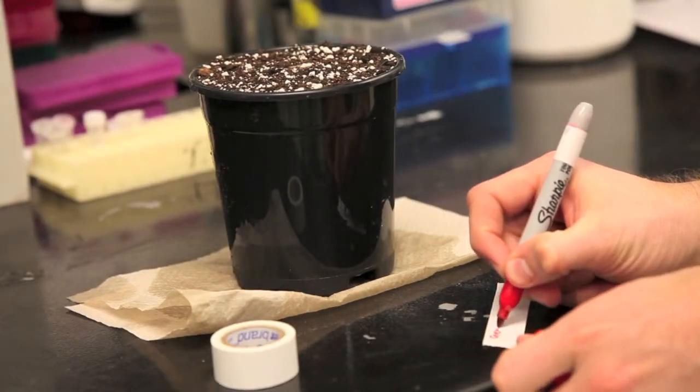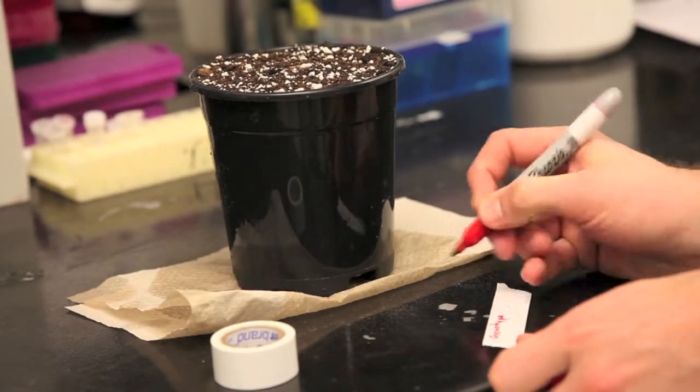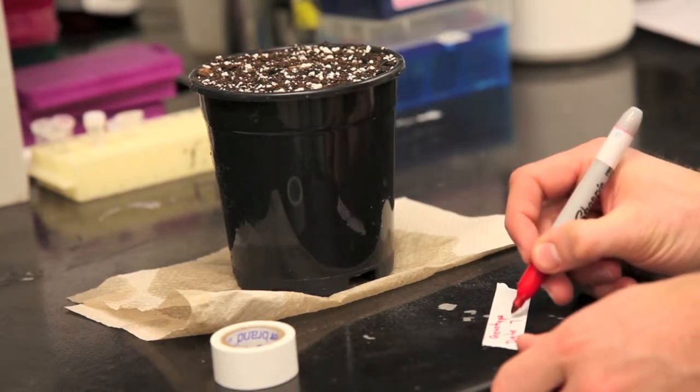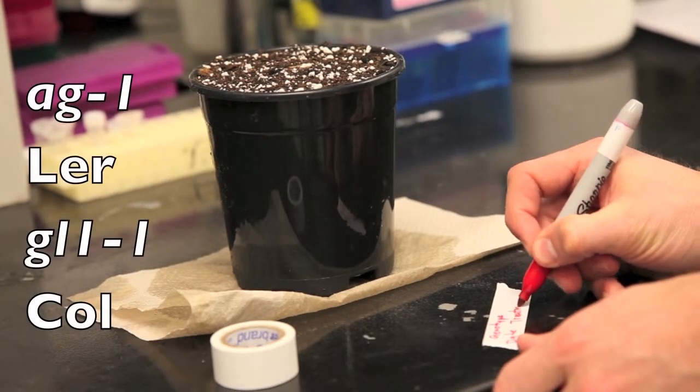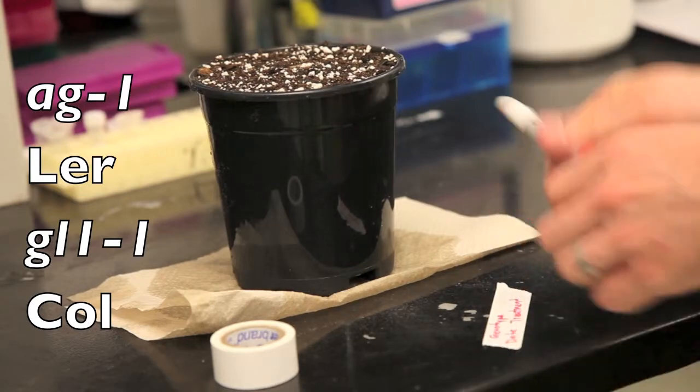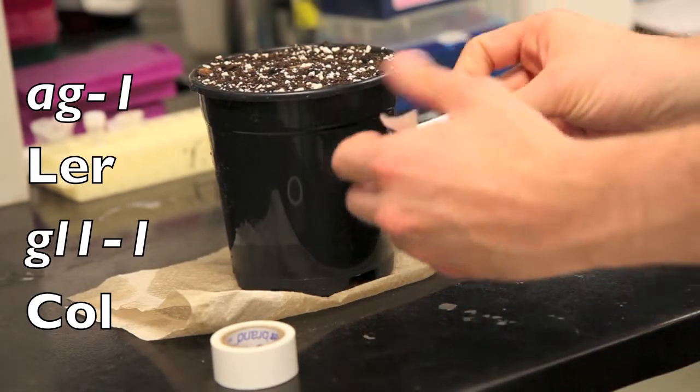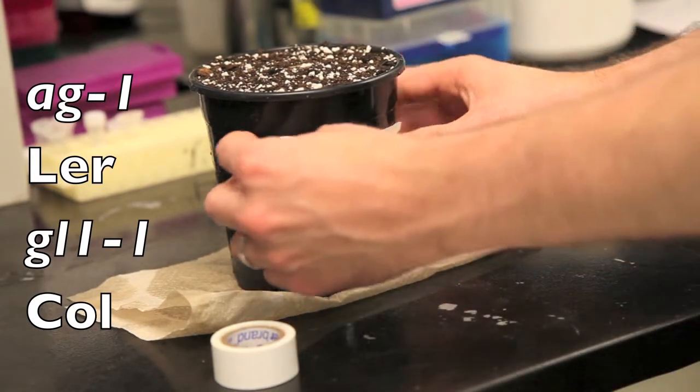As always, make sure to label each pot. Include your group number, the date, and of course the genotype of the seeds you're planting. In this experiment, you should have included AG1, Landsberg, GL1, and Columbia genotypes.